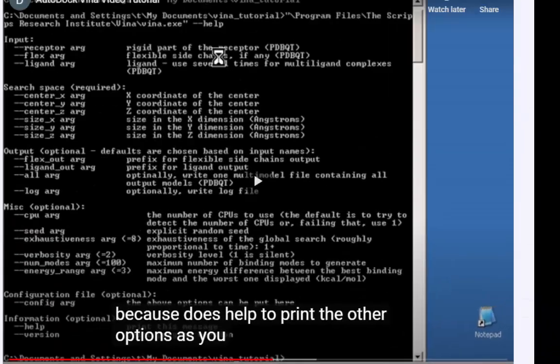Okay, so let's see what he has for us. How do we put this together? I suspect what he's going to do is create a batch file and run this in batch. Rather than do one thing at a time, he's going to put all that, 22, 28, 24, the offsets, etc., in one batch and just run the whole thing as one single script.